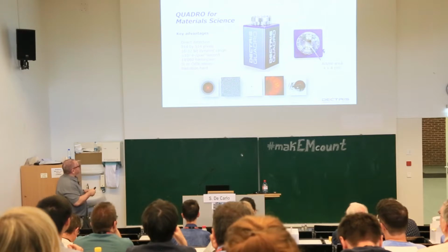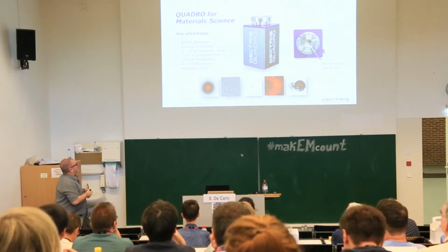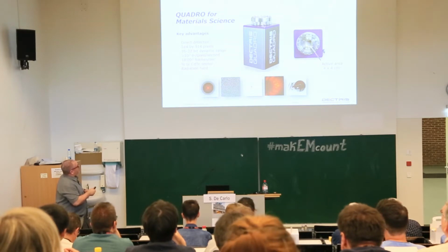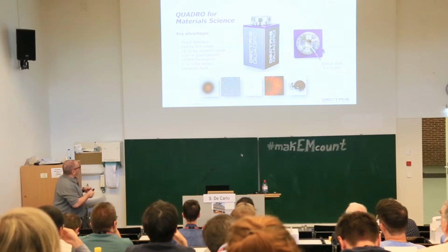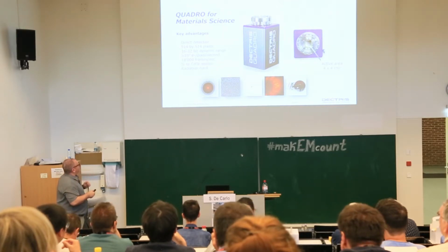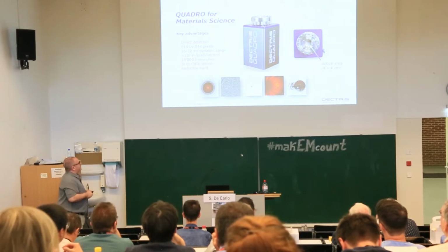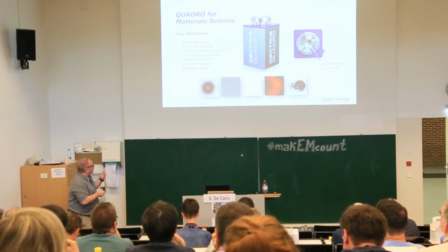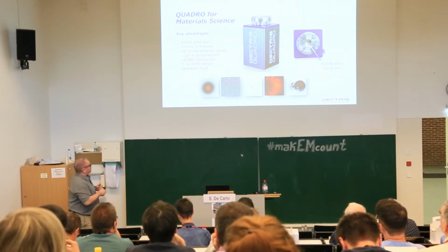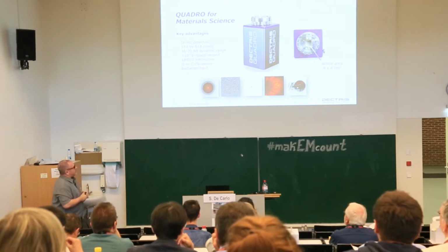As I previously explained, the count rate is pretty high. You can count more than 10 megacounts or electrons per pixel per second. With a region of interest window, we are able to reach 18,000 frames per second. And the interesting part of the Eiger-2 chip is that it's compatible with a silicon sensor, but also high Z sensor for high energy or hard X-rays, and is of course radiation hard.